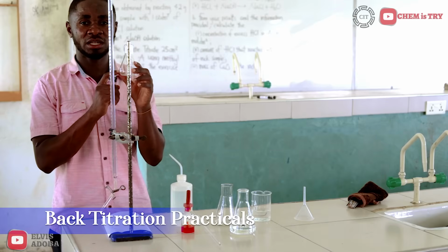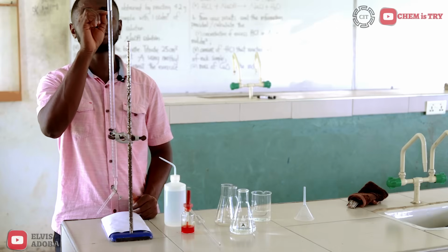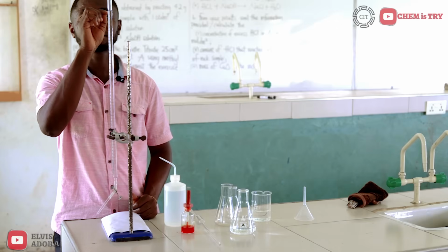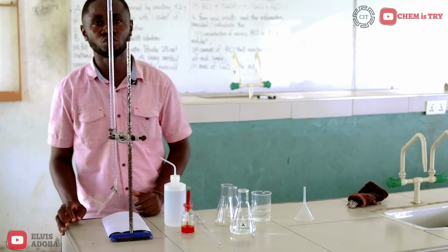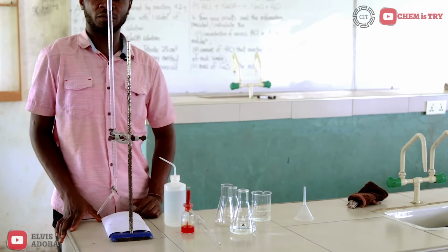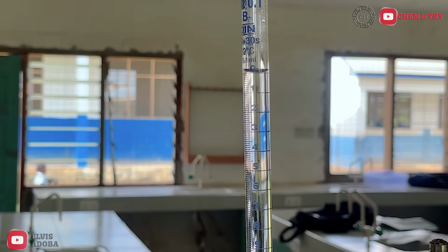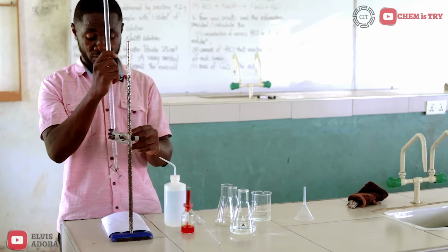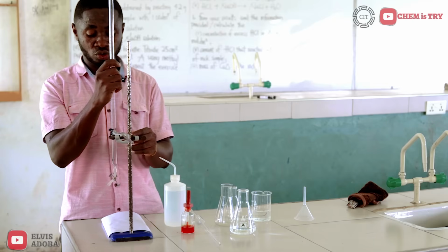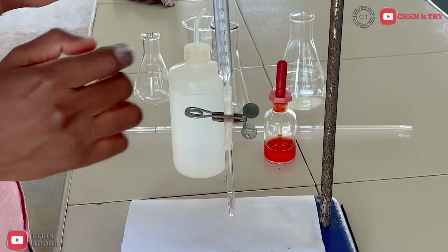Now this solution, I would have to discharge it. So I have my solution on the 0th mark when I read at eye level. I'm not supposed to read from below. I'm not supposed to read from above. I'm supposed to be at eye level. Then I'll pull my burette up a bit so that I can get enough room to place my conical flask.